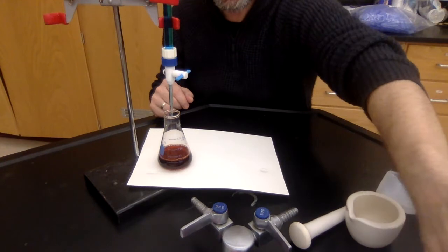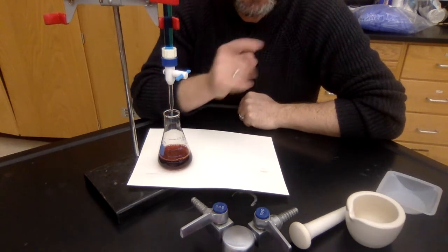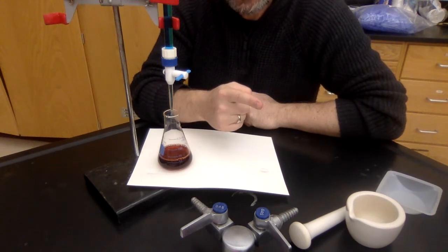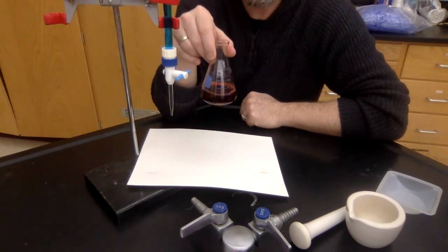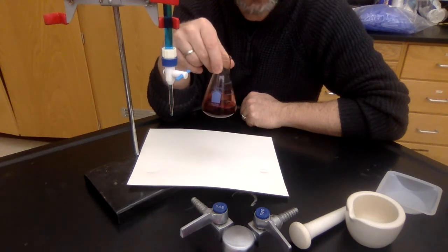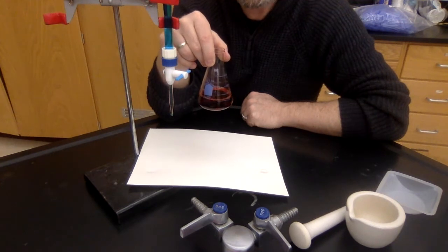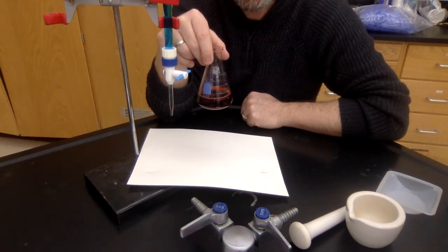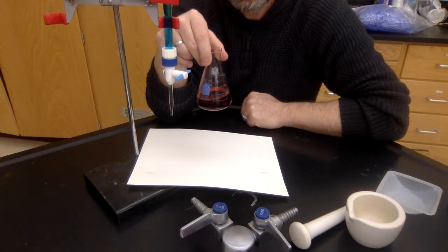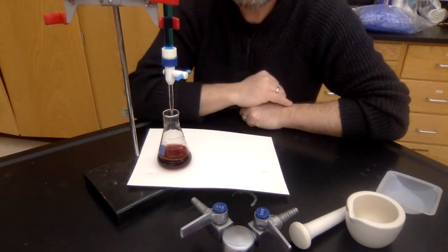And then on day two, I'm going to use a known concentration of that titrant. And I'm going to fix a sample from something interesting, like an orange or some kale or something like that. And day two involves a lot of sample prep. And the titration goes pretty quick on day two. So I think that's probably good for now. For an intro, that'll get you started.